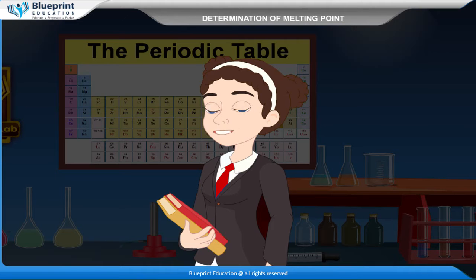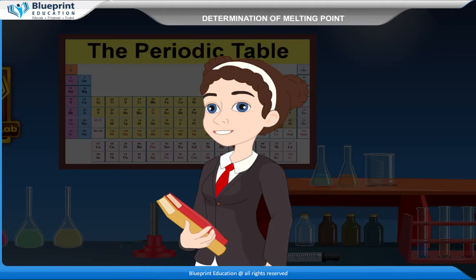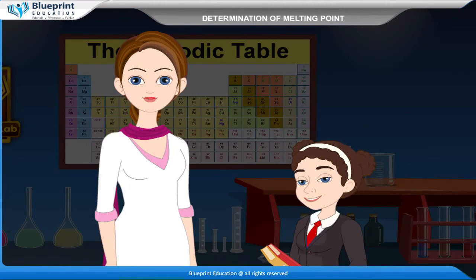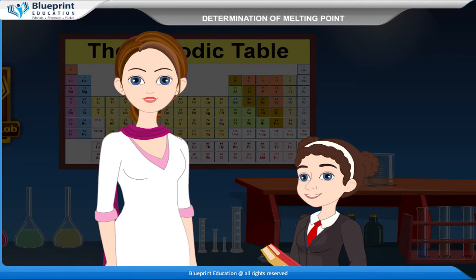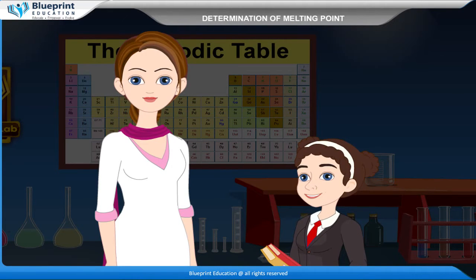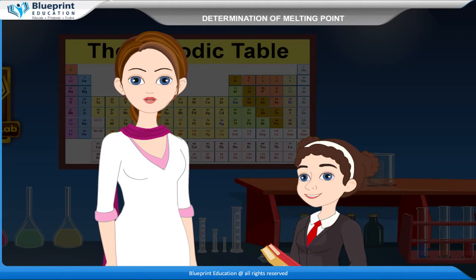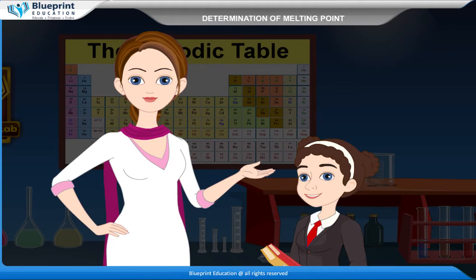How can we determine the melting point? Let us do an experiment to determine the melting point so that you can understand it easily.